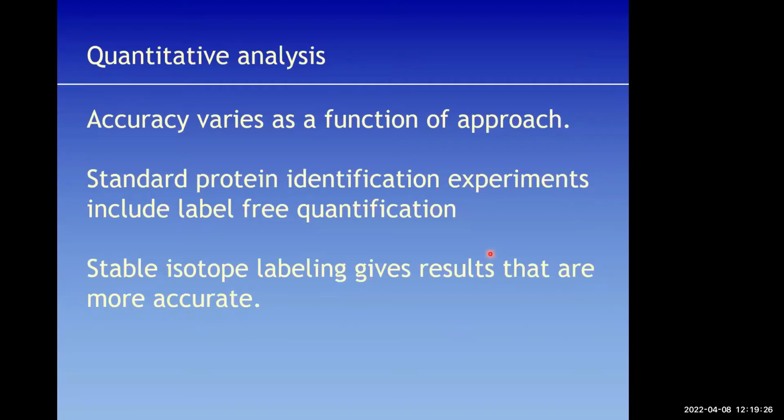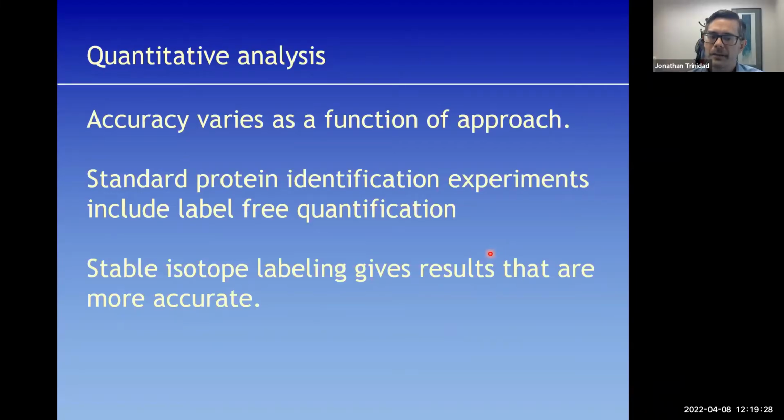For everyday use, we standardly output what's called label-free quantitation. For all the peptides identified, the software can go back and figure out the MS1 level LC-MS intensity. The data is actually pretty good these days compared to earlier generation machines. So even if you don't do anything more than that, you can get pretty good quantitative comparisons across samples.